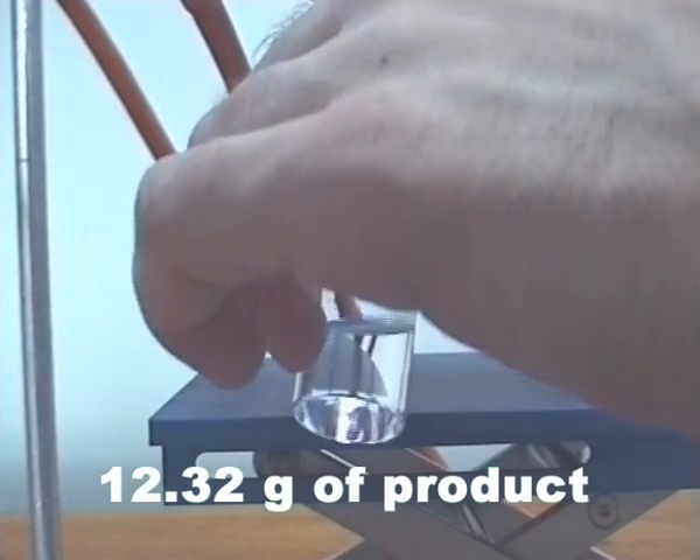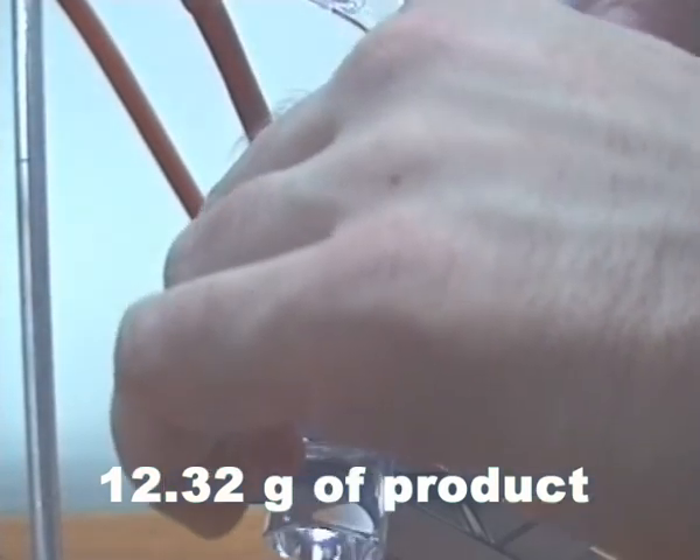12.32 grams of distilled product was collected.